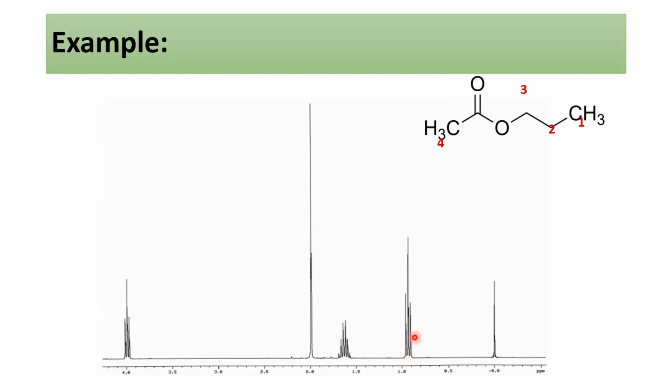So which one will correspond to this chemical shift? 1, 2, 3, 4. Which one? All right, fine. Let's go to the highest then. Which one would correspond to this chemical shift? 3? Everybody agrees? Okay, why is it 3? Because I'm assuming it's you, Vanessa, who says that. It's the most deshielded. So she said 3. She said 3 is the most deshielded.